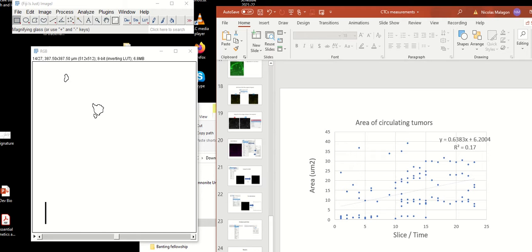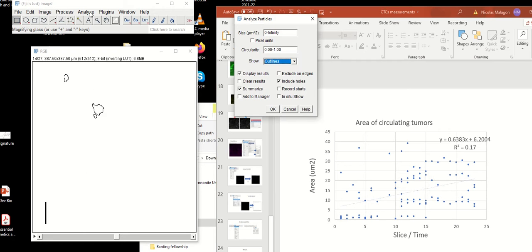If you have any doubt, just let me know. I think this is not complicated, but there are always small things, small problems. And remember, you have to have the scale bar before you analyze the data here. Remember that you have to have the scale bar before.